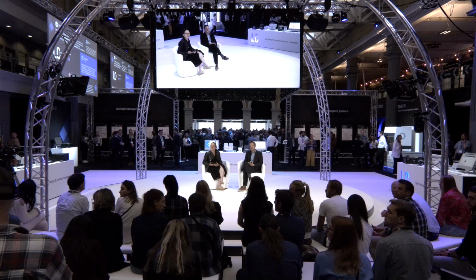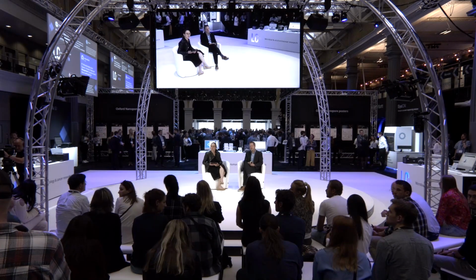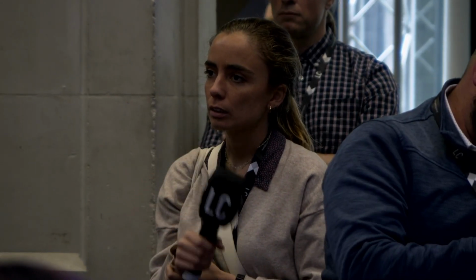We've got a question there from Belen. Hello. Do you know, or do you have experience of any genomic regions that are less efficient in adaptive sampling because of the nature of the region? Do you have experience on that?